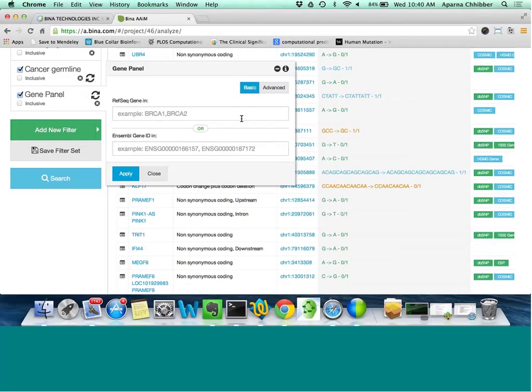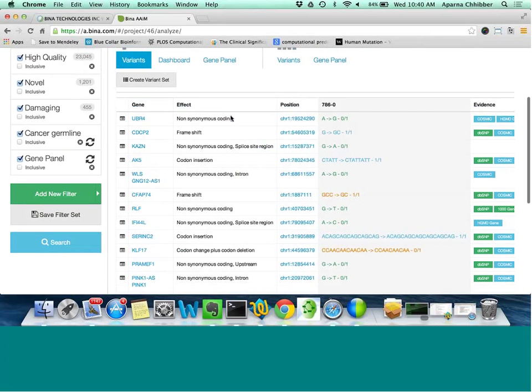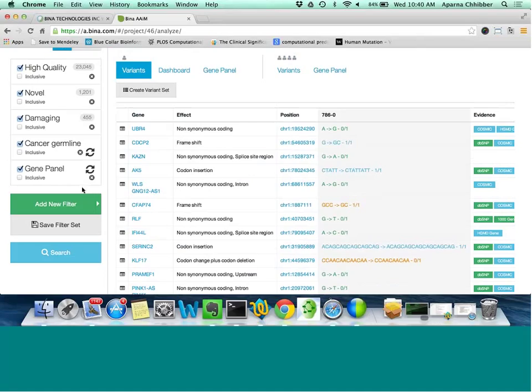There's a question about the clinically actionable gene panel and the pharmacogenomic filter that brought us to P53. The pharmacogenomic filter we made just included all variants that are in the pharmacogenomic mutation database. And this database includes any variant that's been associated with either drug response or toxicity in the past.